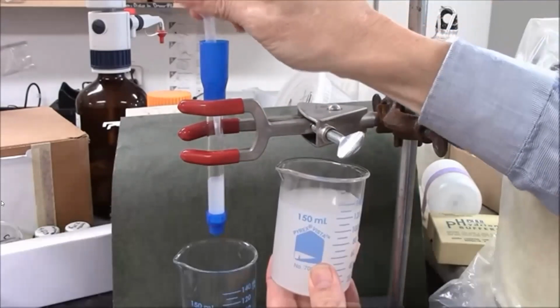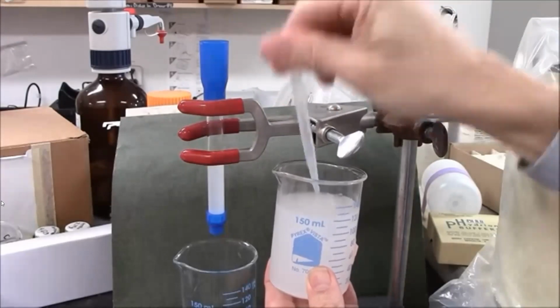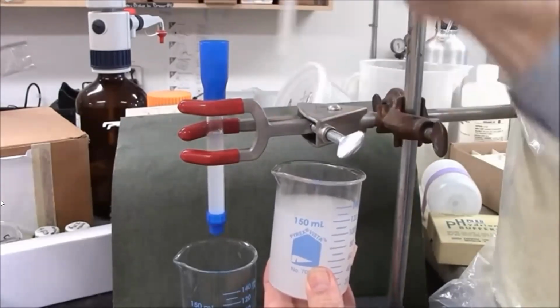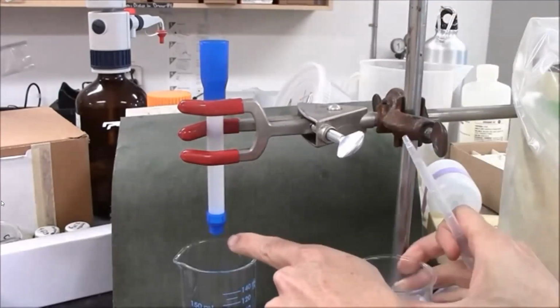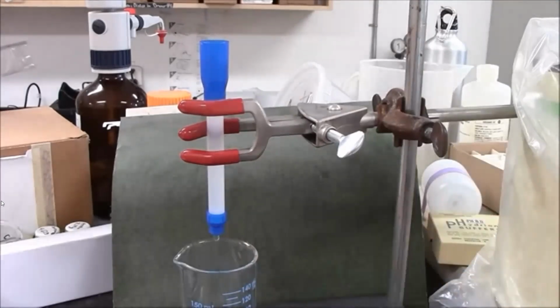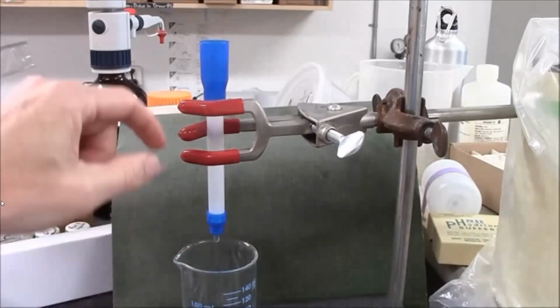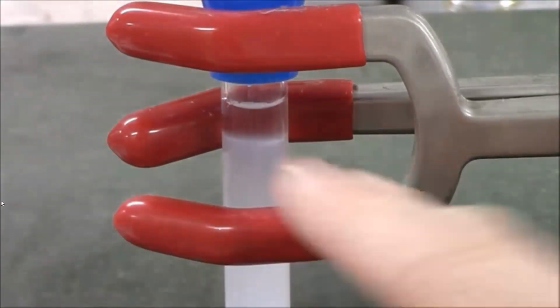For gel filtration, I want a fairly tall gel bed. So I'm trying to mostly fill this column. And excess buffer will drip out the bottom. So here you can see the drips coming out the bottom. Gel bed is starting to settle a little bit. Gel bed is right here.